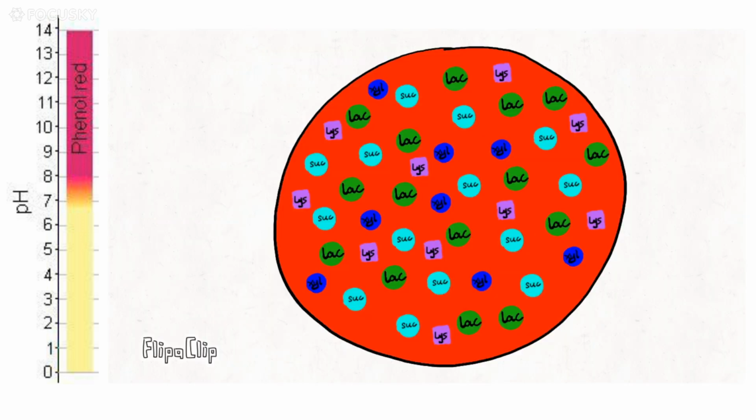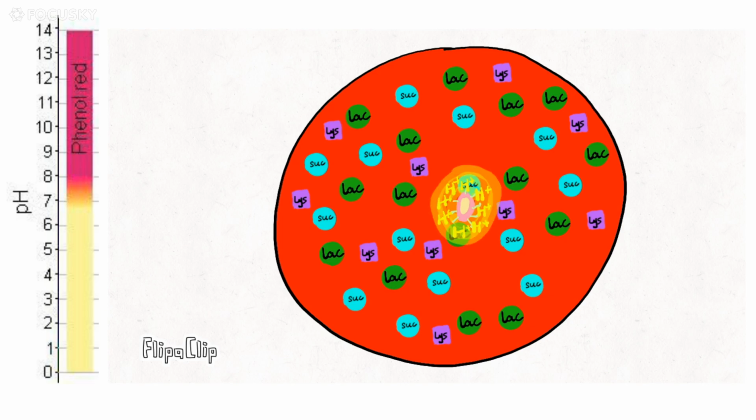Carb is the primary energy source, so Salmonella utilizes sugar before lysine. Among the 3 sugars, Salmonella could only ferment xylose. This process produces acids that turn the medium acidic. Thus, the pH indicator in this medium, phenol red, is changed from red, which is the color at neutral pH, to yellow. However, keep in mind, xylose is in low quantity. The amount of acid being produced in this process is very limited.